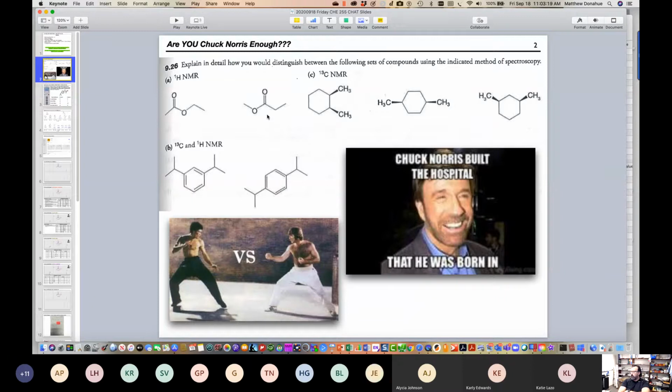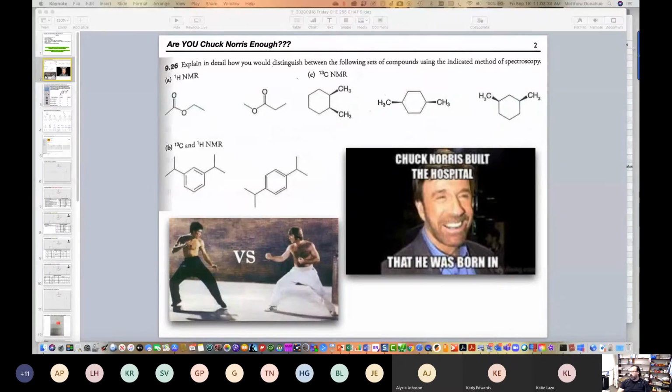So one way you can think about answering is first calculate the molecular formula. So Ian says they both have the same molecular formula. Aiden says they're structural isomers. So maybe we'll refine that word a little bit. Instead of structural, we'll call them constitutional isomers.